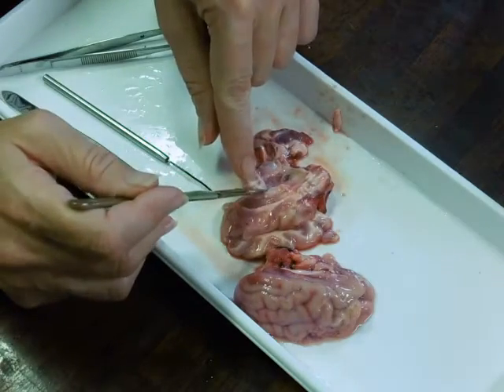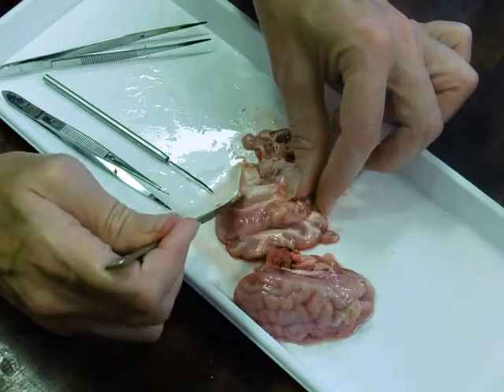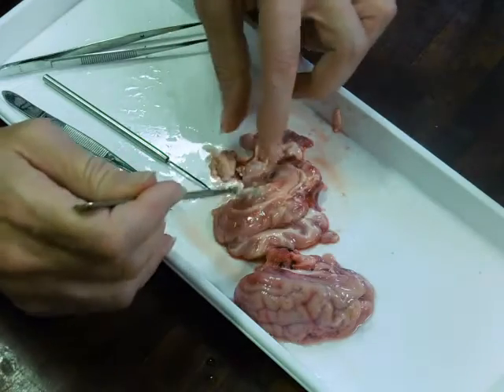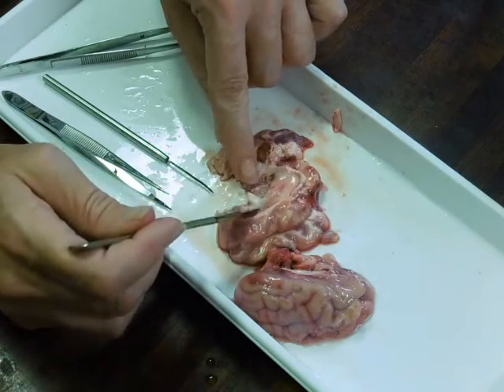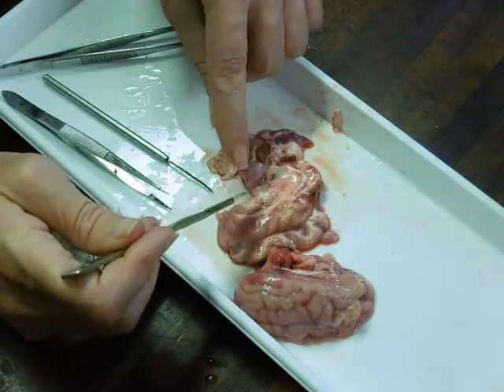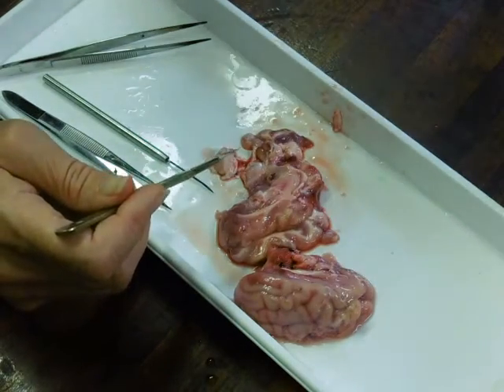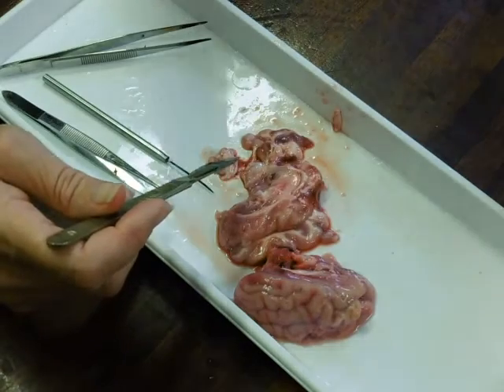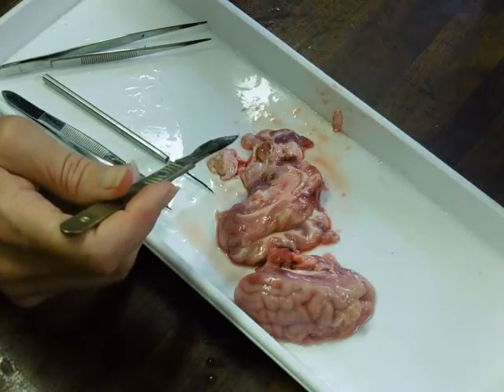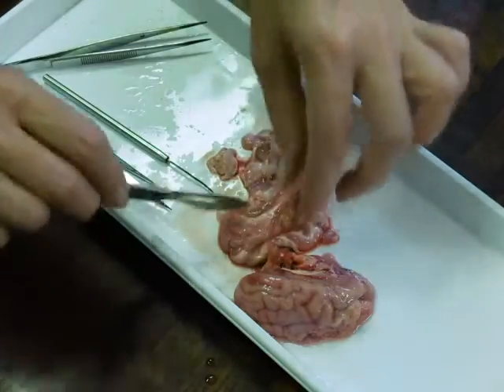Oh, I wonder if that's the pituitary gland there, that little thing there. Maybe this is what I'm cutting through, this white stuff. It doesn't look like anything, does it? There's a little bobbly bit there. I keep saying the pituitary gland because it's something you need to know about. It's just this little bobbly thing that hangs down inside your brain. But it does loads of really cool stuff, like regulates your hormonal cycles, causes you to grow, thirst and weeing, stuff like that, and all sorts of other things. So, oh look!